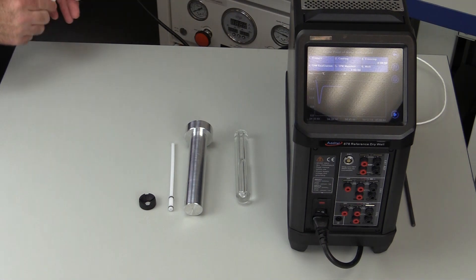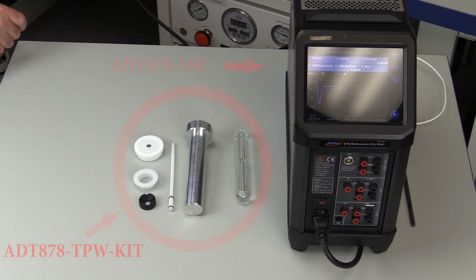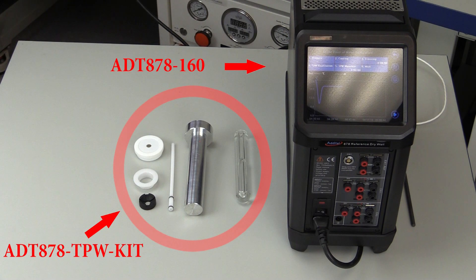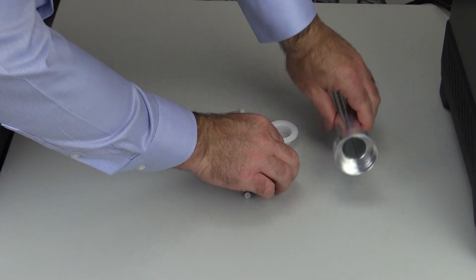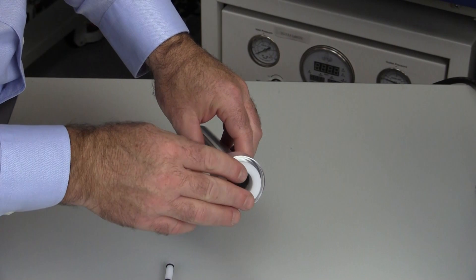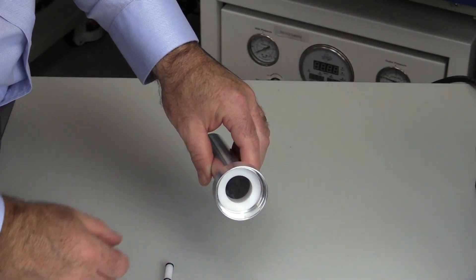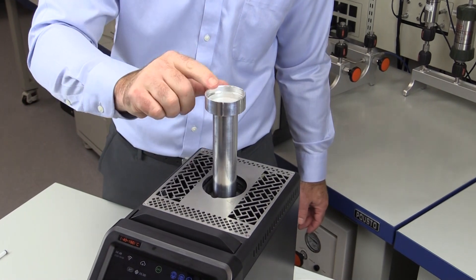To begin, you will need the Additel 878160 reference dry-well calibrator and Additel's triple point of water kit. Start by putting the cell cushion in the bottom of the basket, then put the cell support ring in the top of the basket. This ring will steady the cell when it is inserted. Place the cell basket into the reference dry-well.